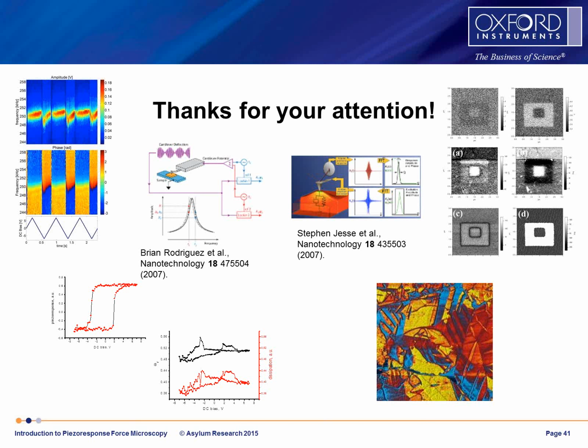It's a little bit counterintuitive, but there are two reasons why it happens. So first of all, in aqueous environment, our cantilever dynamics is different than in air. However, it is different by hydrodynamic functions, so there is a whole set of work by John Sader about it.